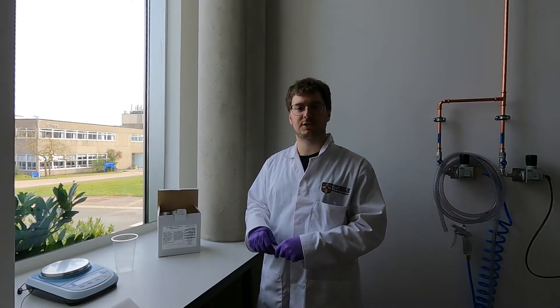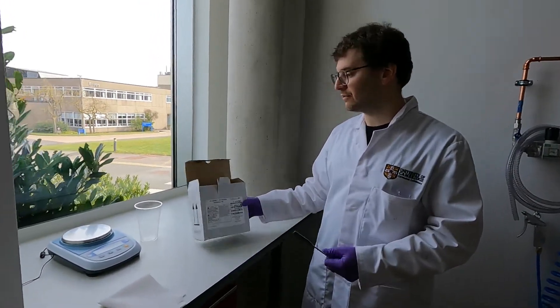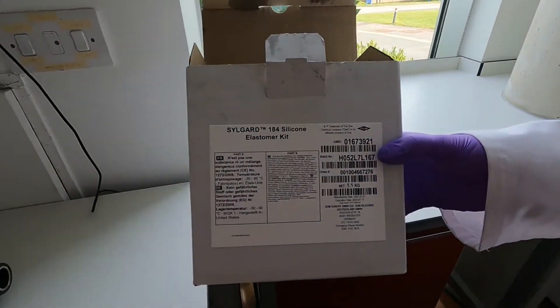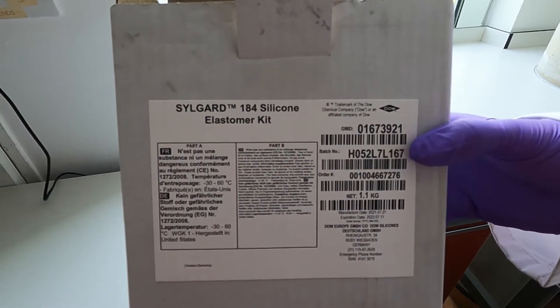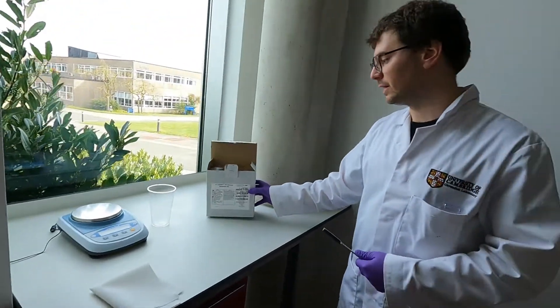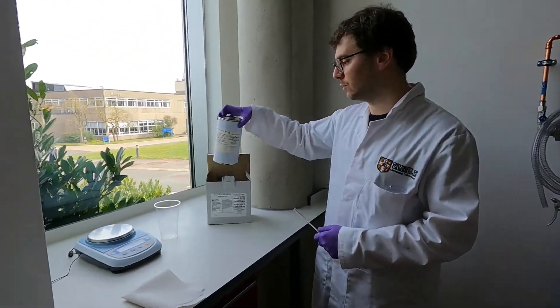The next step in the processing is to actually do the mixing of the PDMS. The PDMS itself is delivered as a kit called Silgard 184 — that's the most common one, but there might also be some other brands available for similar materials. It's delivered in two components.